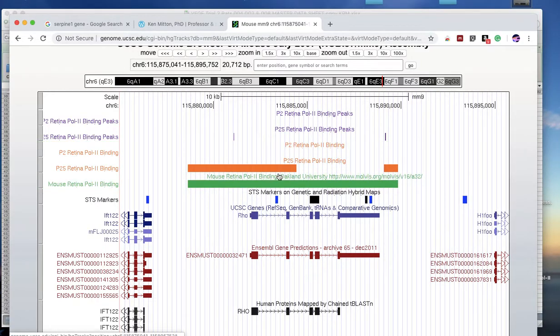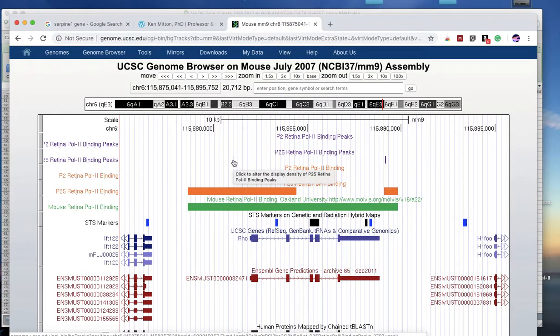And this orange band just tells you that our data picked up a significant amount of RNA polymerase binding in these regions. And it only happens at age 25 when the gene is on, because that's when RNA polymerase will be docking just in front of exon 1 at the proximal promoter, and transcribing RNA. And so it gets stuck to the DNA at different points throughout the gene.